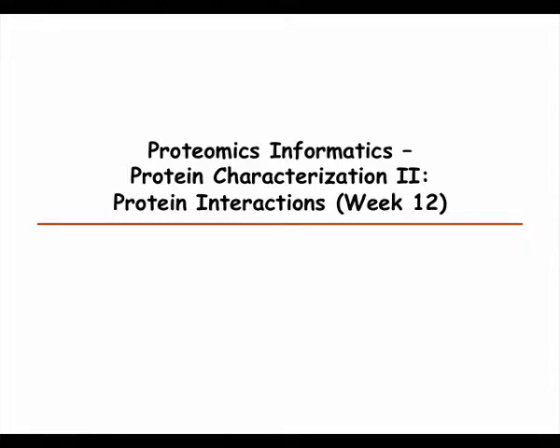So today we're going to continue talking about protein characterization, and in particular about how we can detect and analyze what other proteins a given protein interacts with.